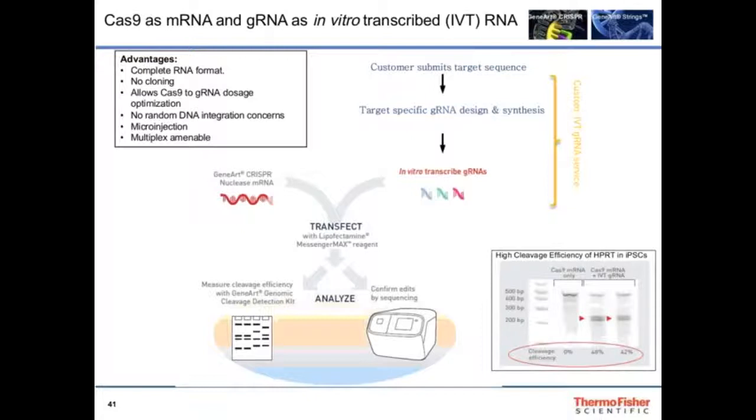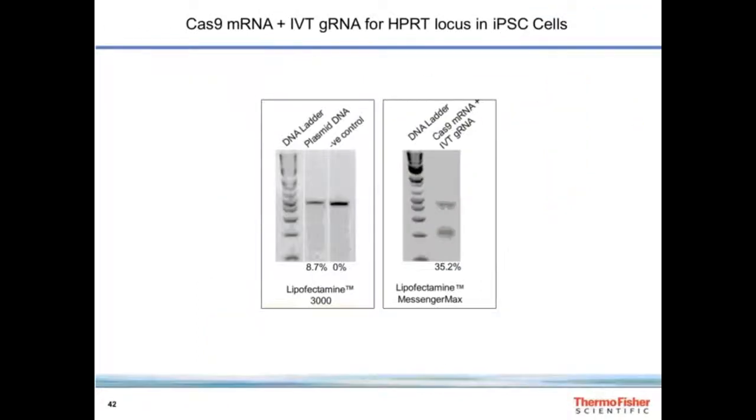We're getting very efficient cleavage, which means when we go back and redo these disease models in iPS cells, instead of screening 100 or 200 colonies, we might get away with screening maybe 20 colonies or maybe 50 colonies. So significantly less work to get to the clone that we're interested in. As I mentioned, it was our goal.